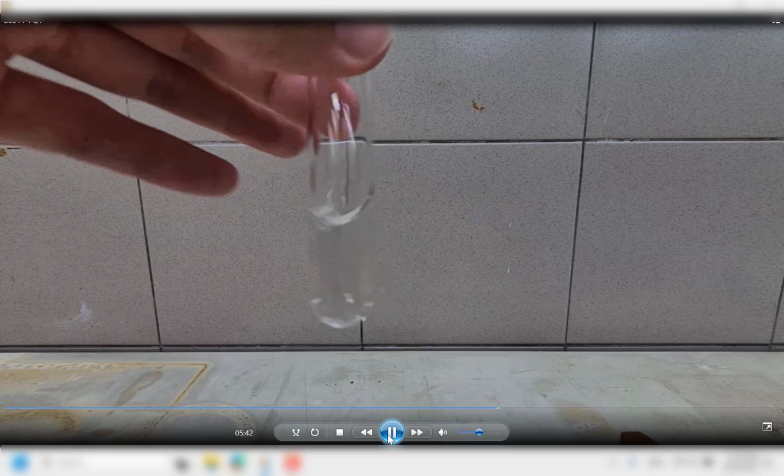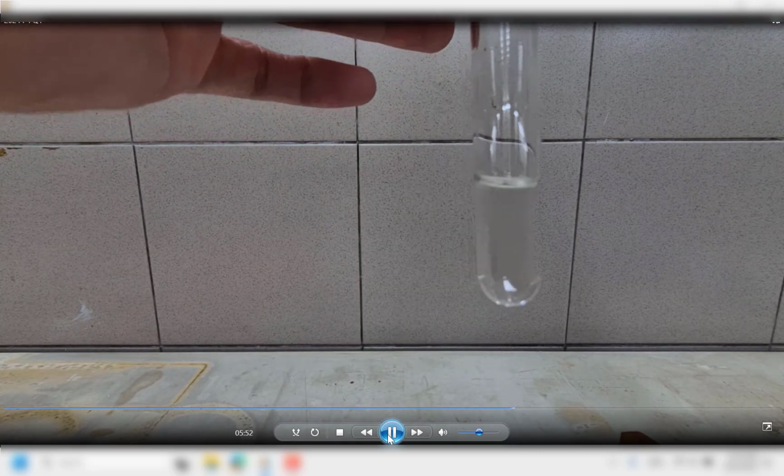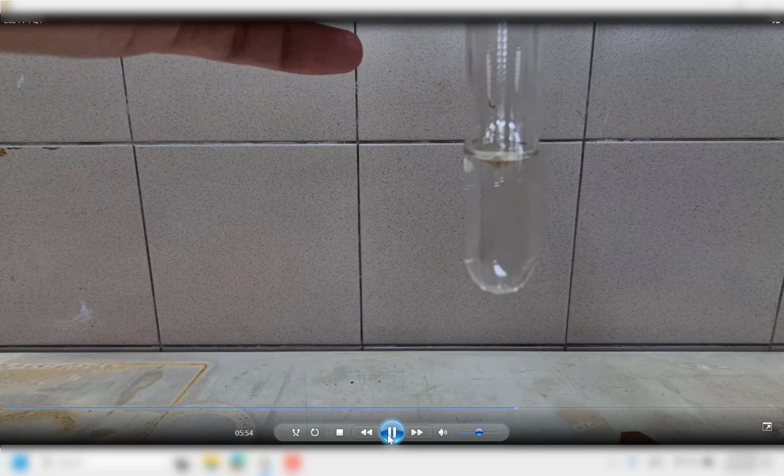Not sure whether anyone of you tried it out during the actual practical exams. You're not recommended to try new things. I'm just saying it, in case you are wondering. And if you wish, maybe we can do a demonstration later on. Okay, so now we are adding hydrogen peroxide. I'm going to rewind again, because this is the interesting part that I think a lot of us have not done before.